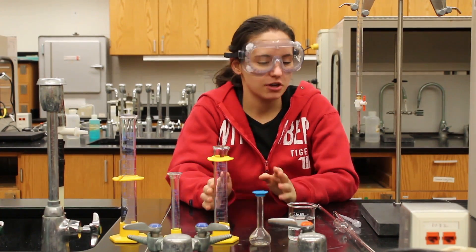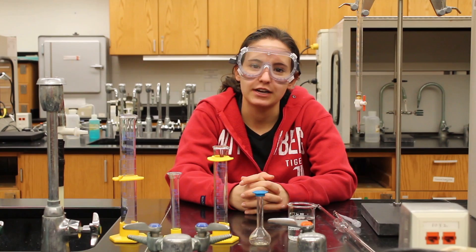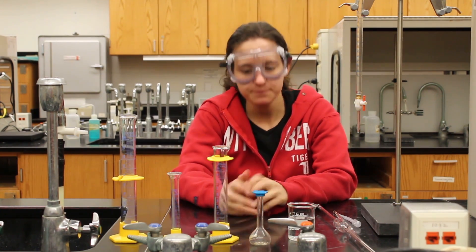Hi there, it's Jackie again. In this video I will be showing you how to measure using graduated glassware.